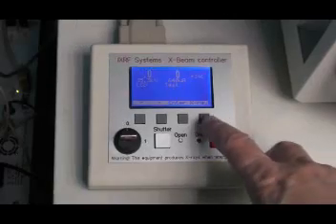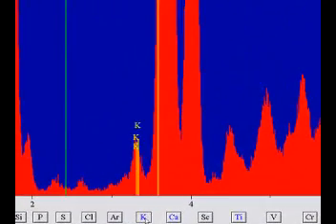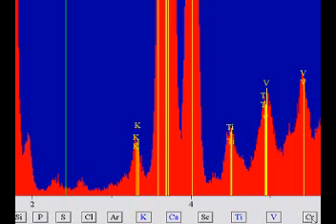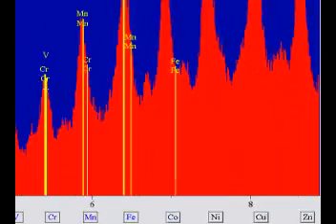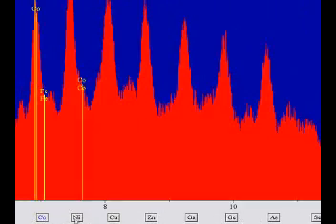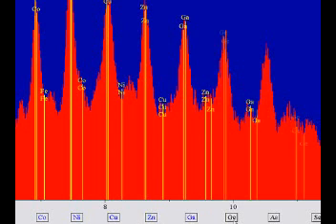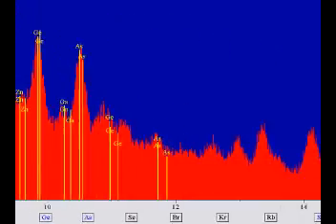Now let's try the FX-SIM tube. X-rays on, lights on. Just a few more peaks — it's ideal for almost every element on the periodic table. The best thing about the complement to EDS analysis is that the higher the energy, the more sensitive XRF becomes.